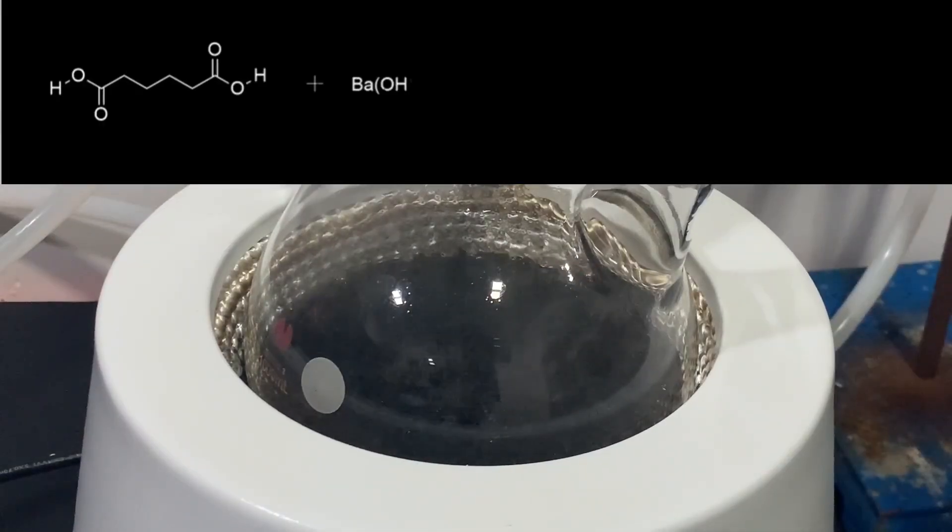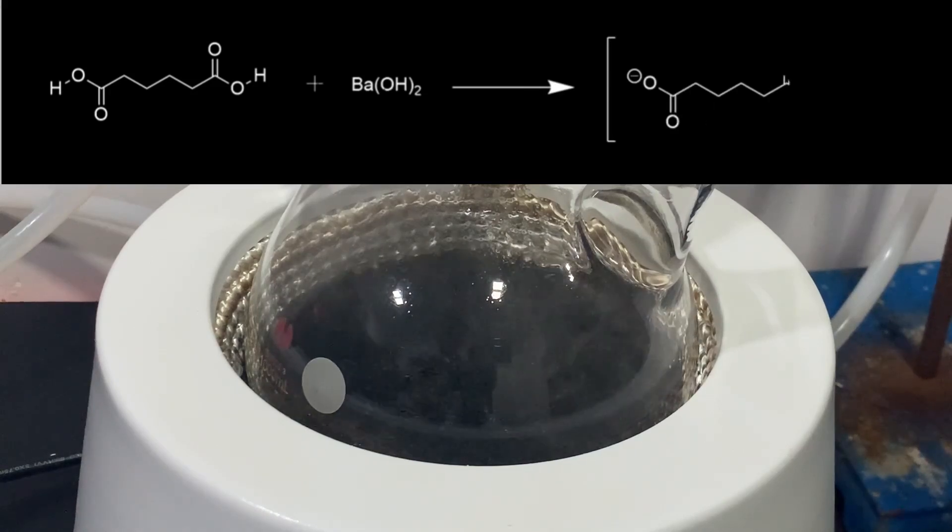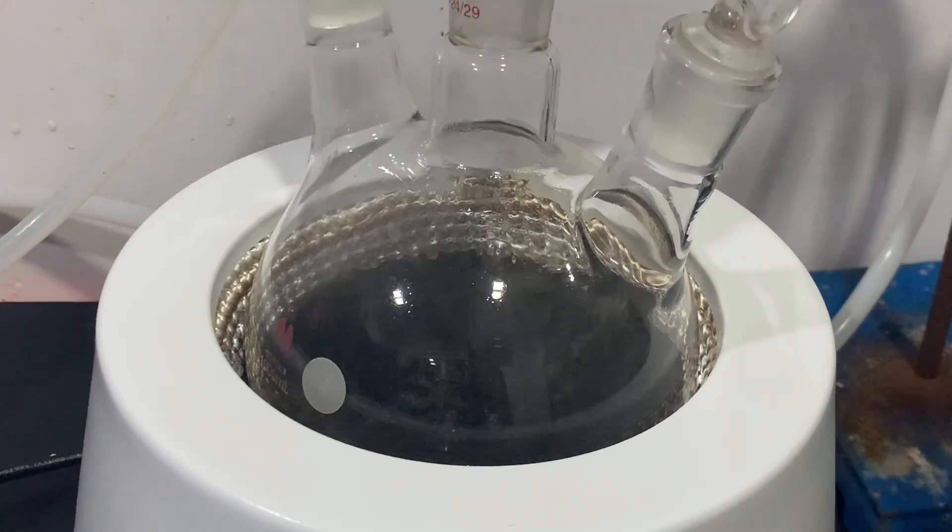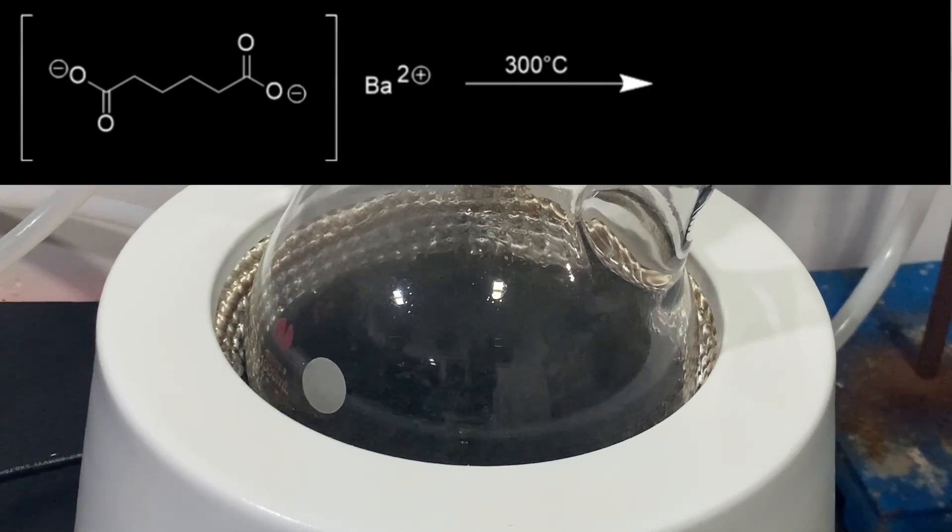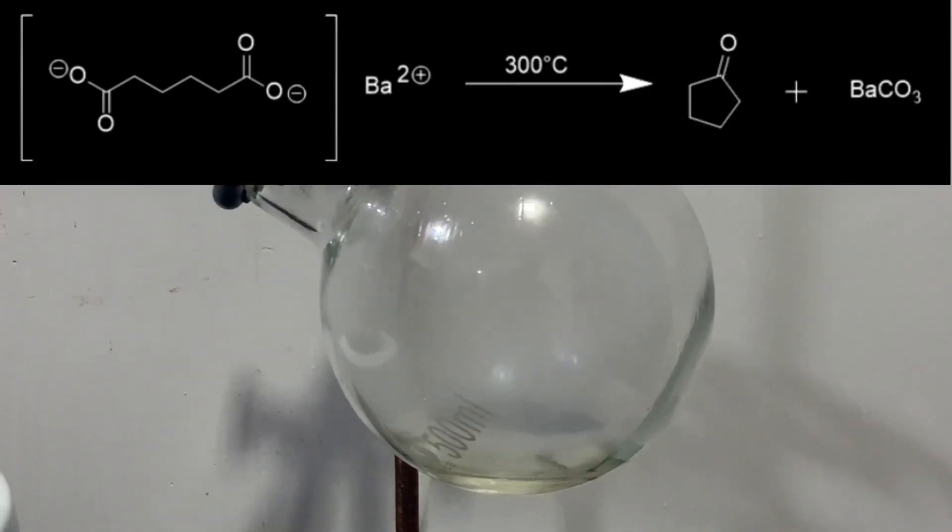In the first step of the reaction, adipic acid is deprotonated by barium hydroxide to form barium adipate and water. At a temperature of 300 degrees Celsius, the barium adipate decomposes into cyclopentanone and barium carbonate.